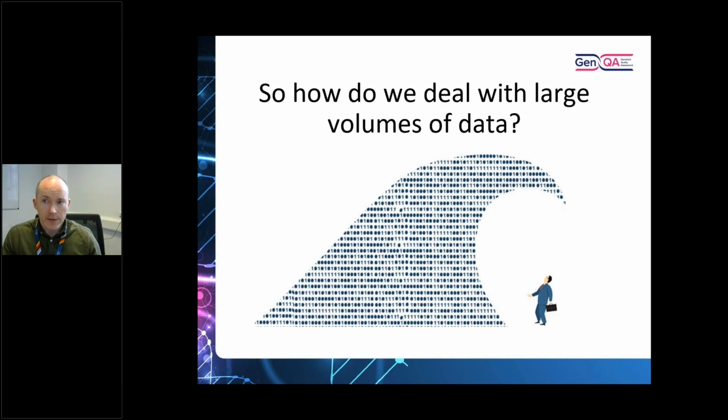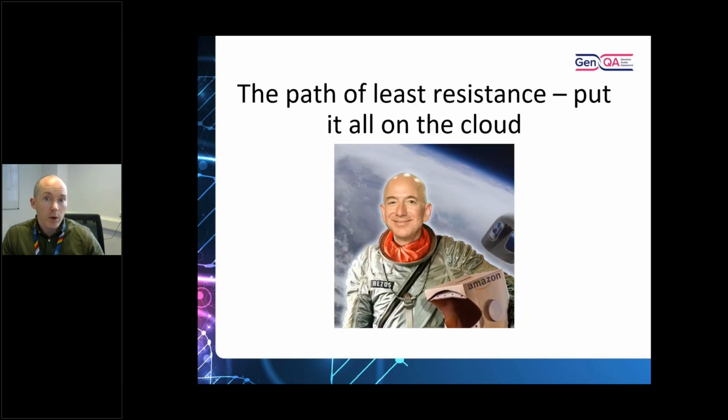If we go to the next slide, please, and what the purpose sometimes of doing that is. The path of least resistance, I think, for a lot of services, hospitals, and health systems, is if you have cloud computing set up, you send it to the cloud and you don't really think about it anymore. Since cloud computing has become very popular and there's been a lot of buzz about it, it seems like the sort of thing where you just put it in the cloud, it's easy.